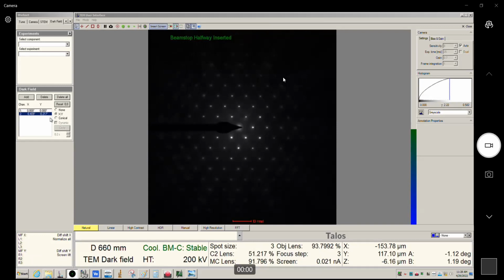We actually saw that when I was going over the rotation center, and we saw how the image looked really crappy when I tilted the beam really far away from how it was supposed to be. So effectively, I'm doing the exact same thing here. But here I'm not doing it for the purpose of getting a better image. I'm doing it just to align along the zone axis, because the zone axis wasn't perfectly aligned with the incident beam to begin with. So I reversed the process and tilted the beam to go along the zone axis. If that makes any sense.